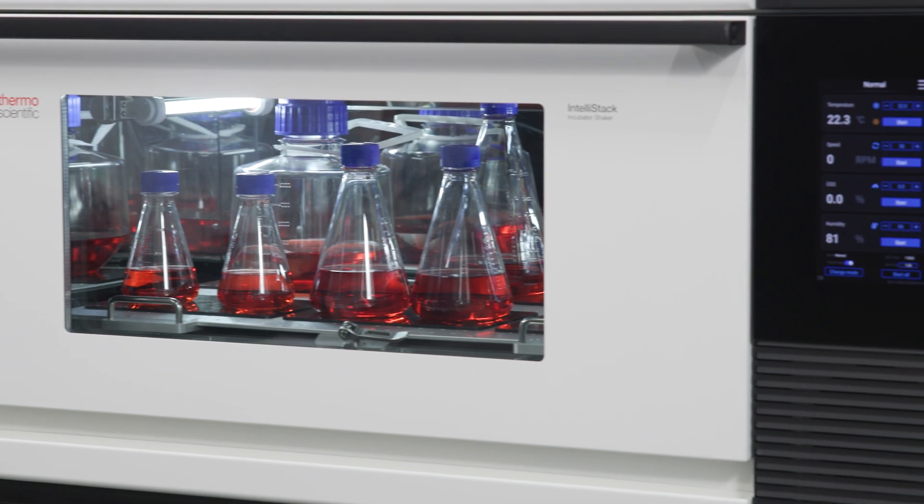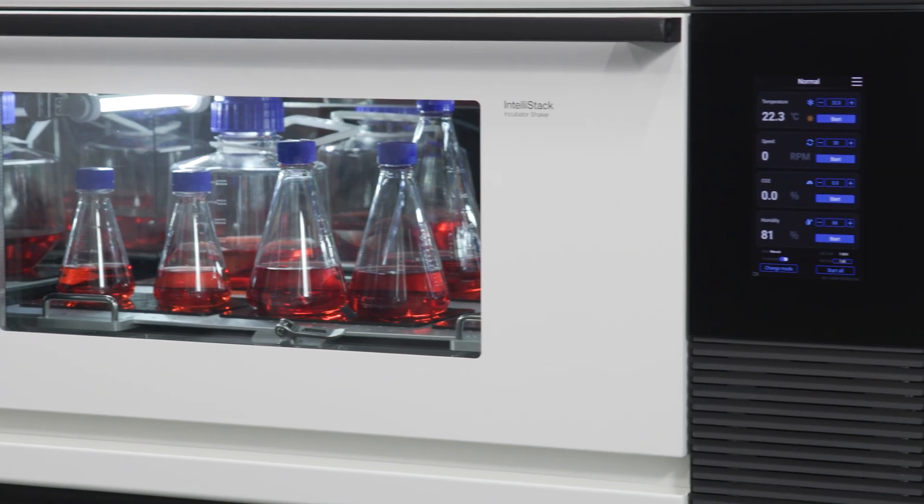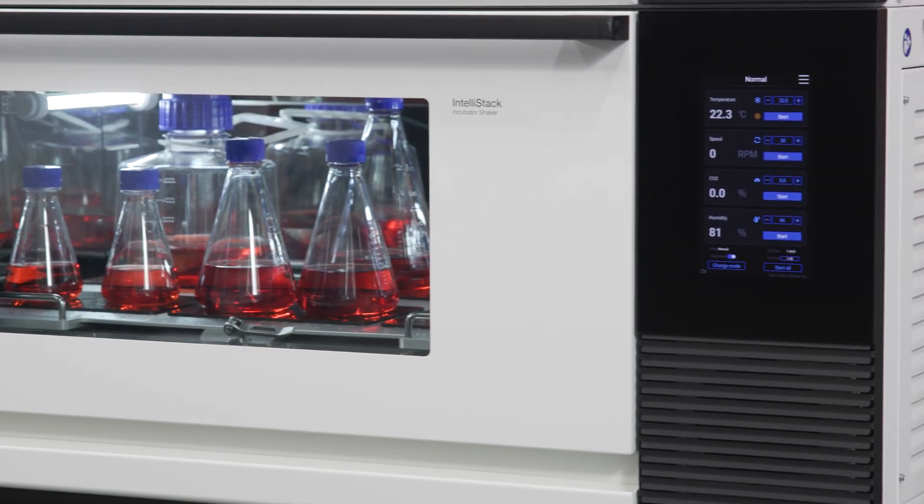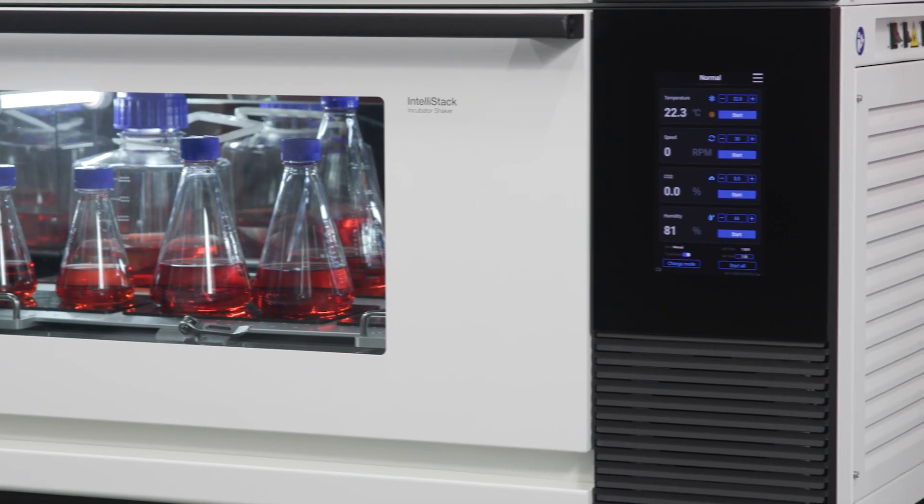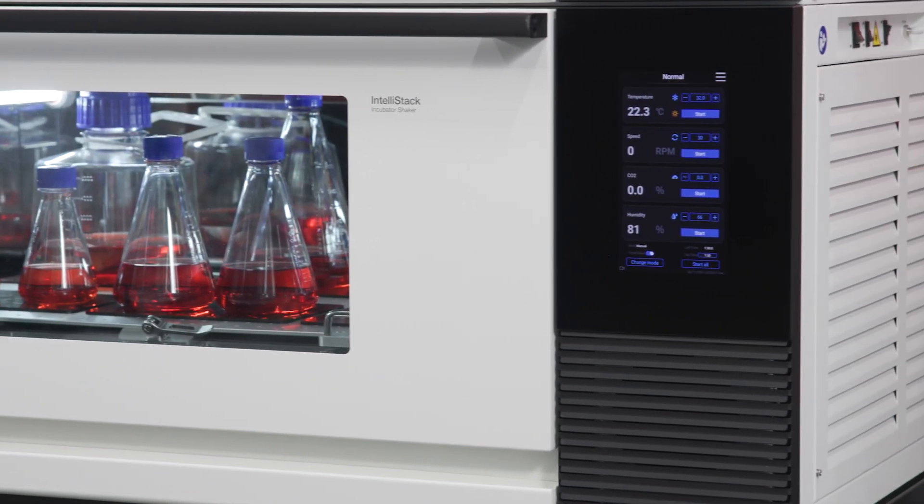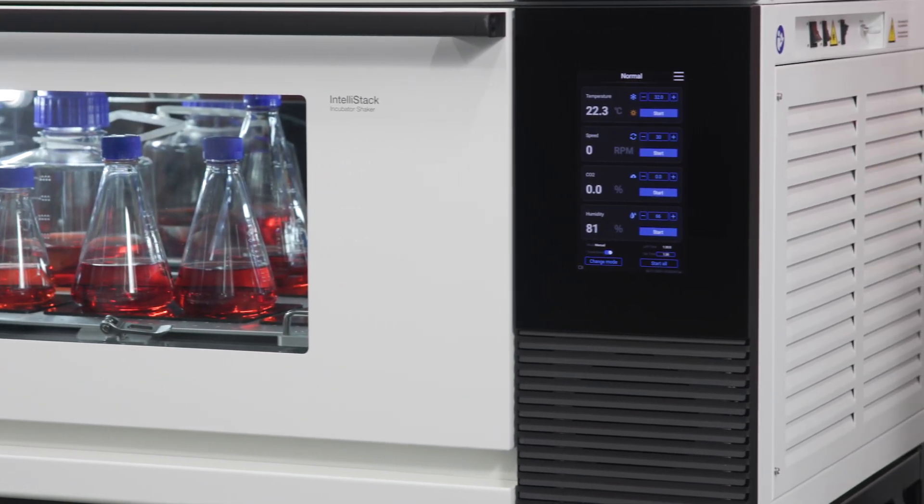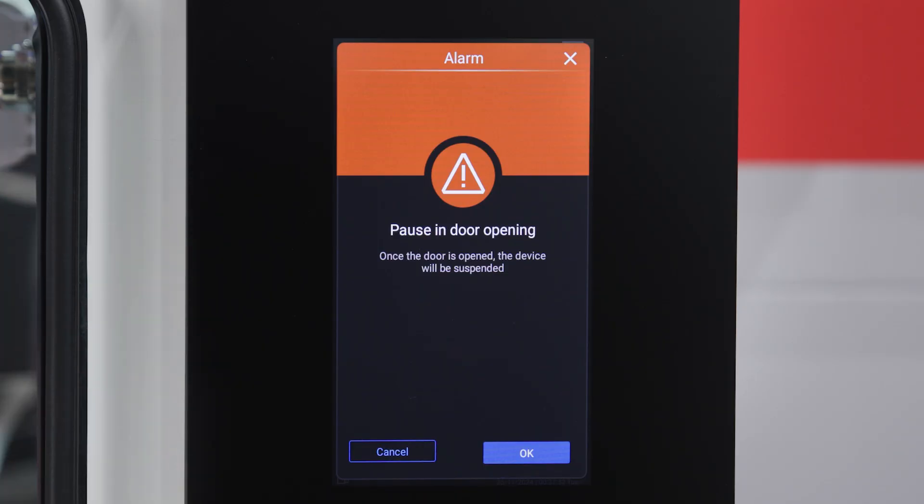Environmental conditions, unintended user changes, and other factors could interfere with or disrupt your shaker's performance. Should any of these or others occur, and the IntelliStack experiences an alarm, it displays on the main interface.